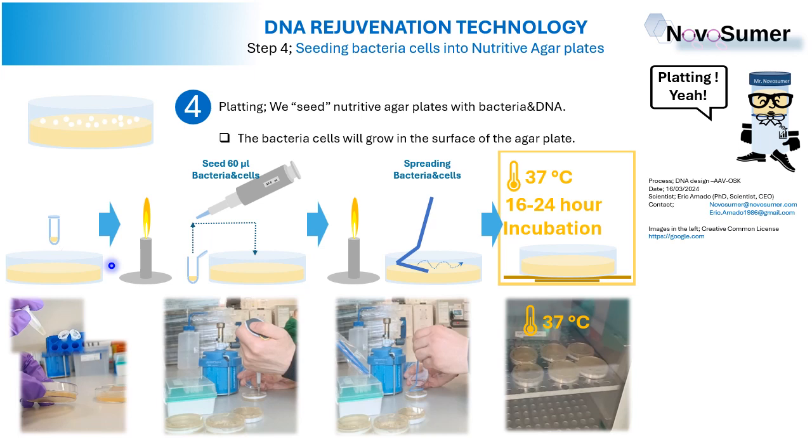Okay, so once we have the recovered cells and the agar plates, what do we do? Well, we do as I'm going to describe to you. Remember, we need to work under sterile conditions with the flame, right? This step is just transferring 60 microliters of these recovered cells into an agar plate, as you can see here.